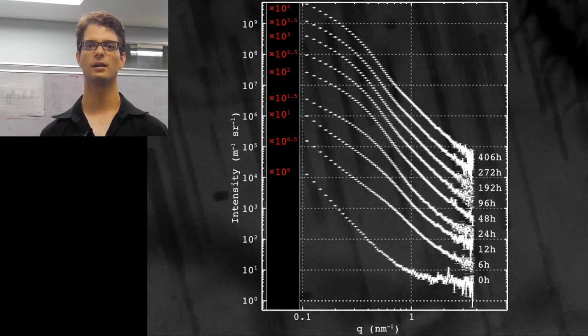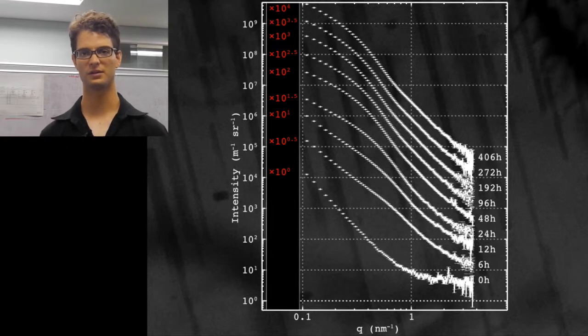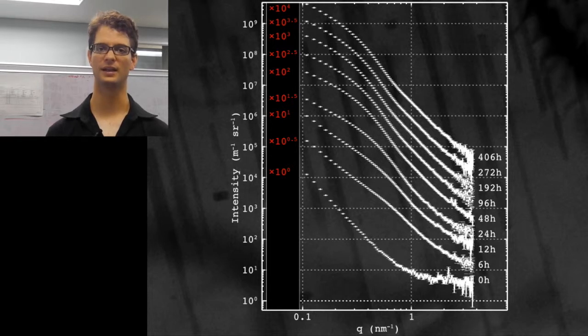We collected a lot of small angle scattering patterns for this alloy for a variety of aging times. The higher the aging time, the more of these rod-like precipitates we have inside the alloy.